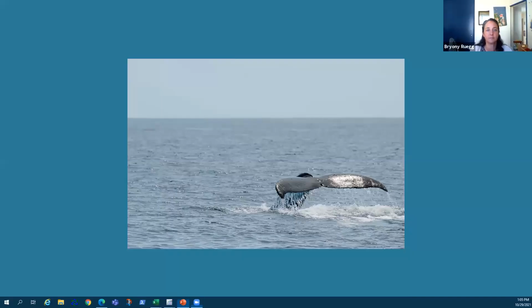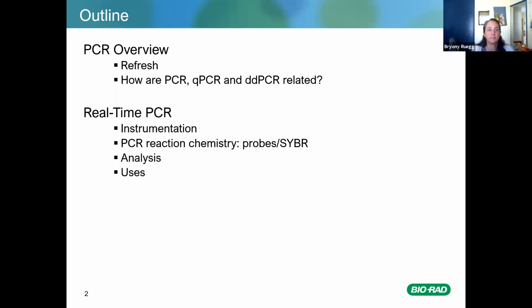Thanks, Bryony. Okay, let me get this started. Hi, everyone. We'll start with a brief overview of PCR that we talked about last time, and then we'll move into real-time PCR and a little bit about the instrumentation, the reaction chemistries that are typically used, analysis, and then a little bit about the uses.